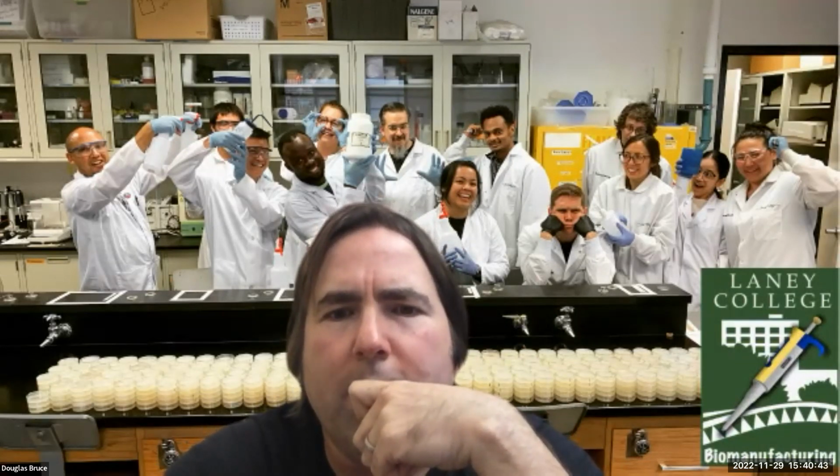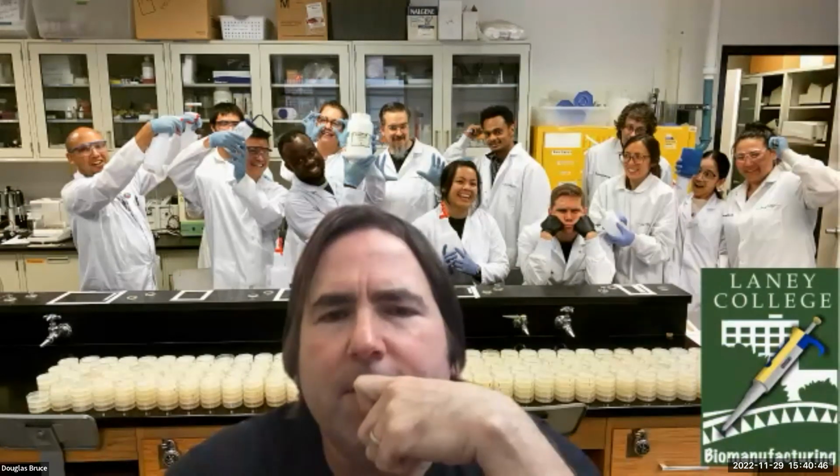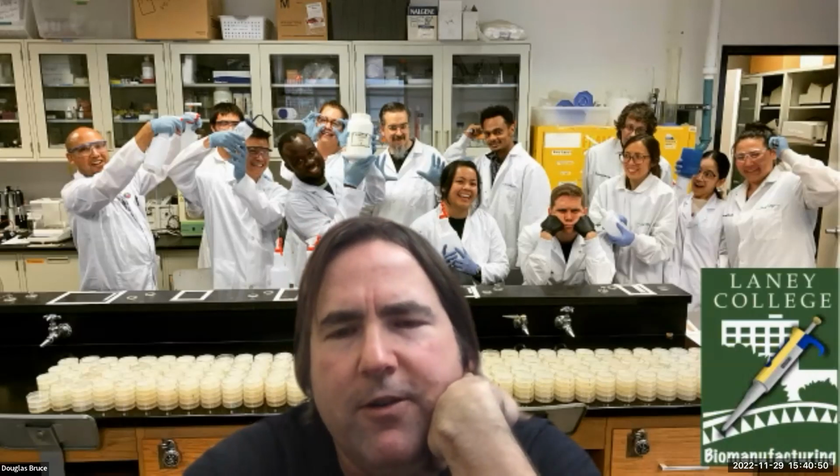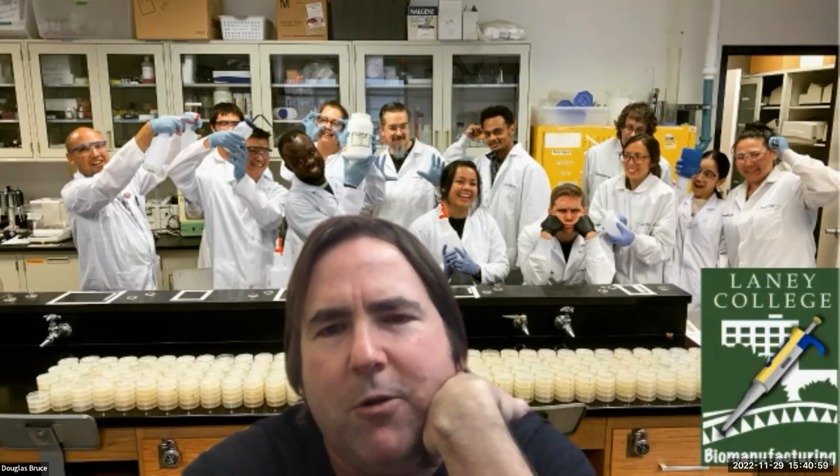Okay, and one other thing I was wondering about is you mentioned dealcoholization of beer, and I was really curious about the point you made about how it sounded like they would use a nanofilter, but also use diafiltration to bring back in some of the flavor. Can you talk more about that?